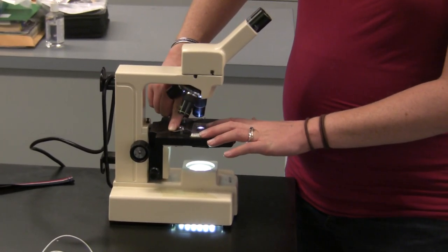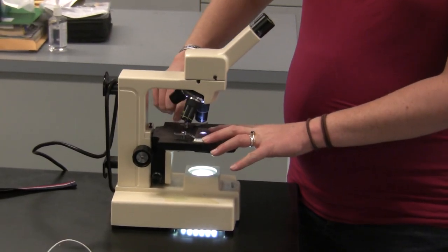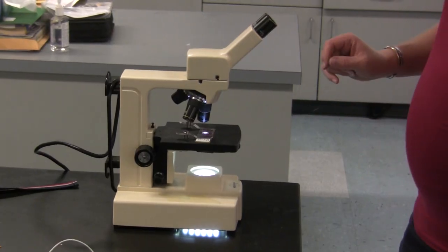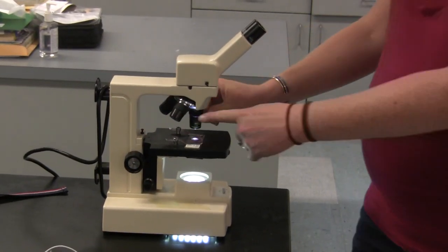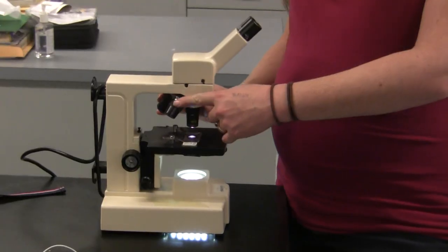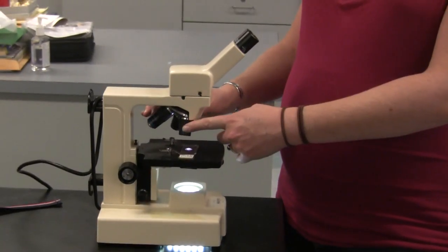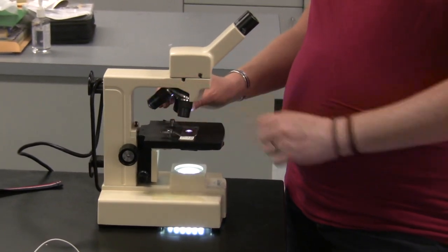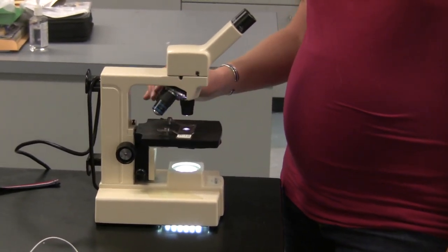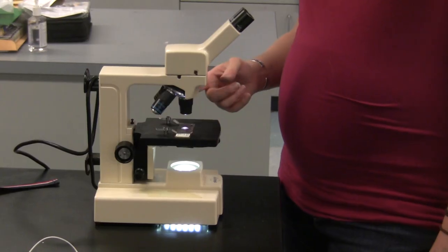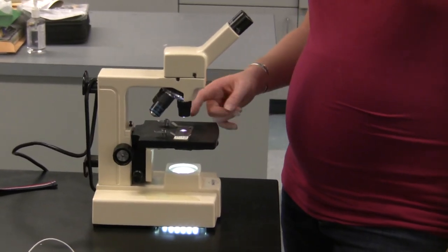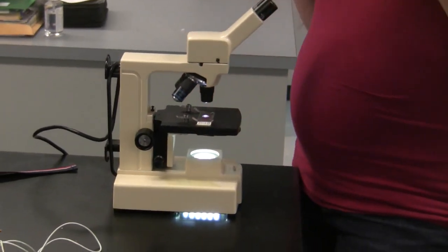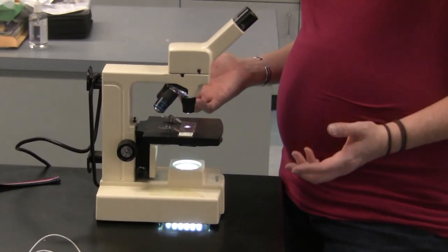So you place the slide on the stage and clip it down with the stage clips. You also want to rotate your lenses, these are the objective lenses, around so that the shortest lens is clicked into place and you can hear it. So once the short lens is clicked into place, you can center your slide so that you have the highest likelihood of actually seeing anything.